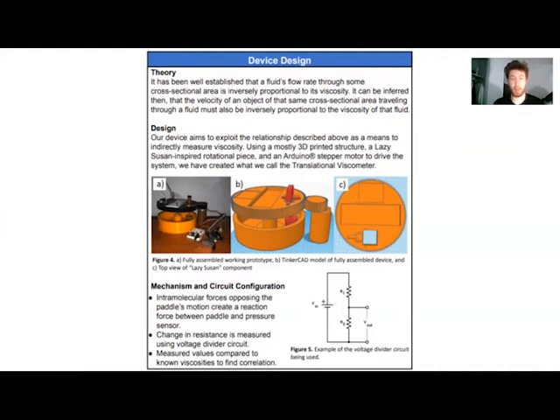And then there's the sample holder. There's not really much to explain there. It's just a specially designed container that's compatible with the rest of our design. The motor, we're using an Arduino stepper motor to drive the motion of the system. We considered using a DC motor for a little bit, but we didn't feel we'd have enough control over the actual velocity, so we stuck with the stepper motor.